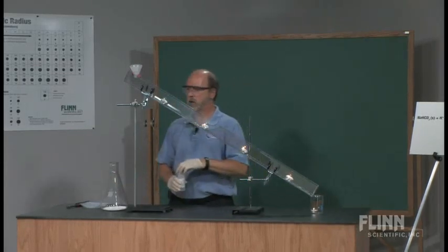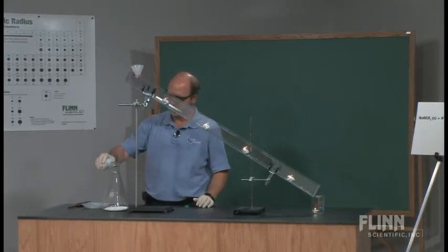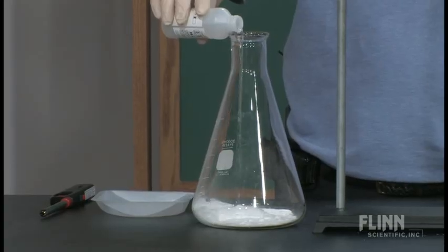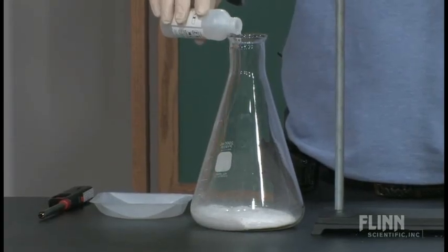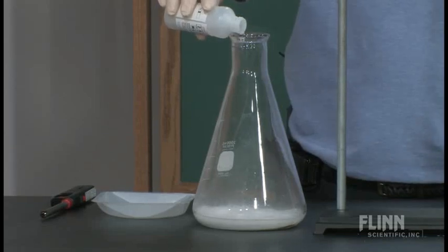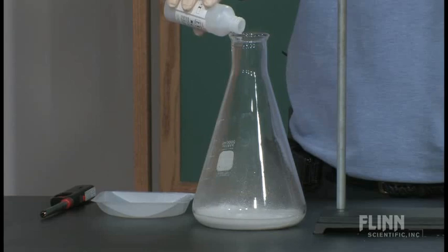Again, I'm going to generate some carbon dioxide. This flask is slightly larger than the previous one. Then again, I have a slightly larger apparatus.